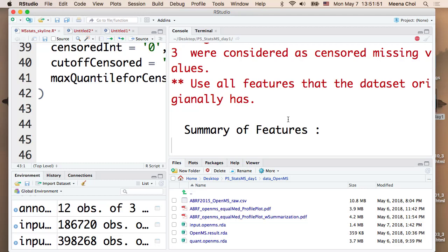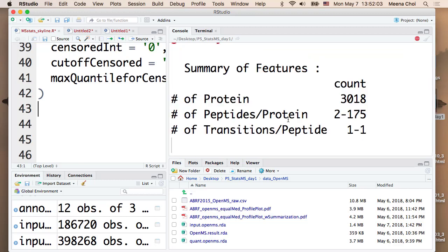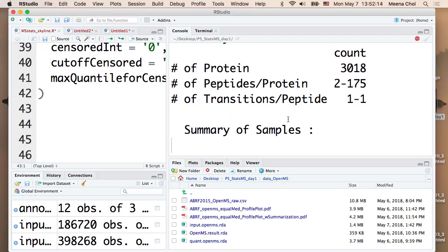So if you want to use this platform for some different type of data, this part you have to care about. Here's the big assumption. In this case, the intensity value should be 1 or bigger. So if you have a data set of ratios, which can potentially have a minus value or 0.0 or something like this, you have to think about this before you use it.